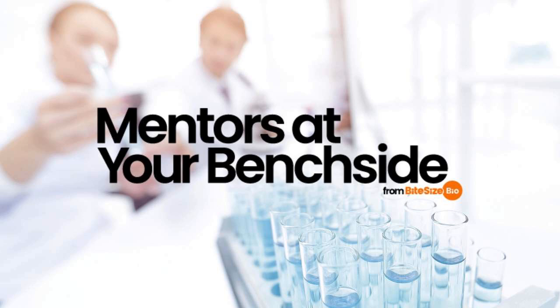Perform pre-sequencing quality control checks on nuclei samples. Many downstream applications for extracted nuclei are expensive and lengthy. Plus, you get a large amount of complex data, which will be either degraded in quality or hard to interpret if the starting sample is poor. Therefore, spending some time on quality control to gauge the suitability of your sample for your intended application is paramount.